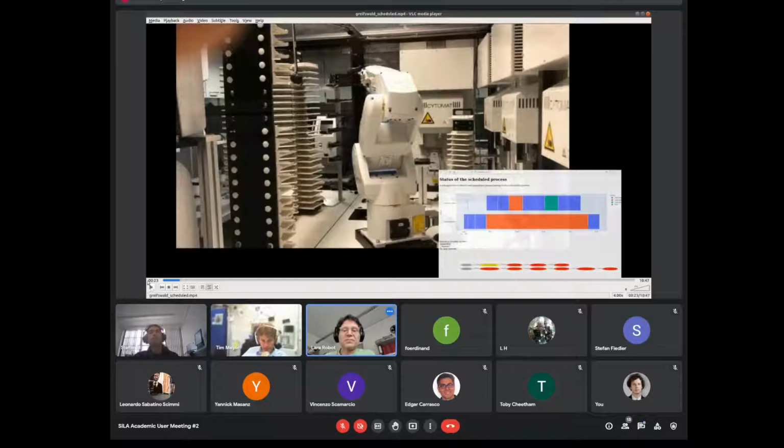Okay, good. In the bottom right, you see the screen on my laptop, where you see the supposed schedule of the steps. The workflow graph turns yellow and green when a step is in operation and after it's done.